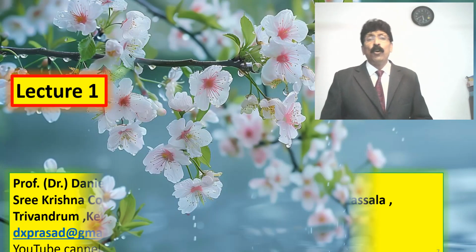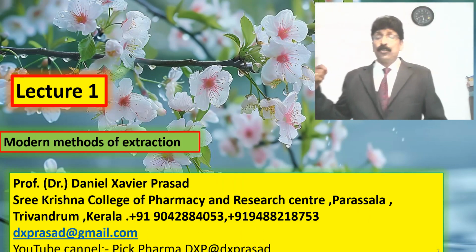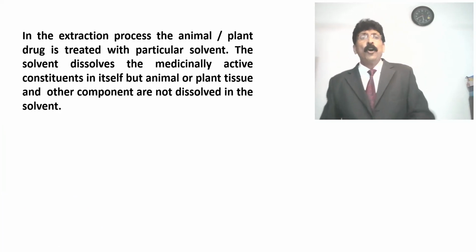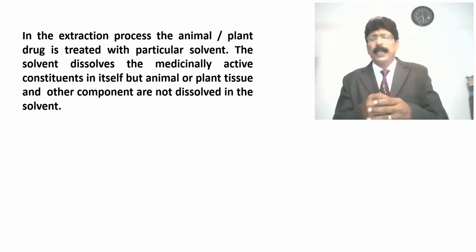Now we will go to the small class, lecture 1, regarding modern methods of extraction. I cannot go for the complete extraction today, but still I can come up to the Soxhlet apparatus, because it is needed for you today. So when you talk about extraction, very simply, the definition should be clearly explained.